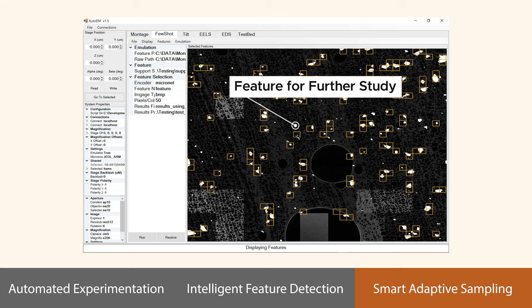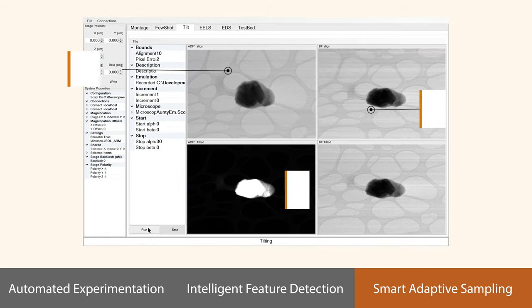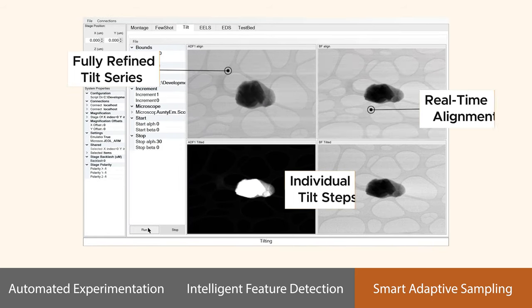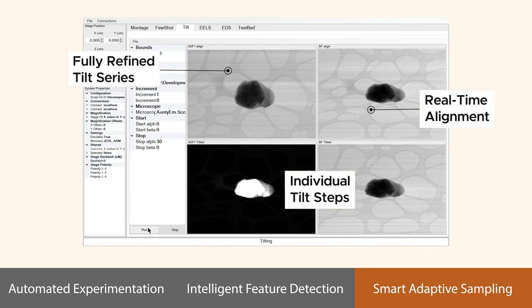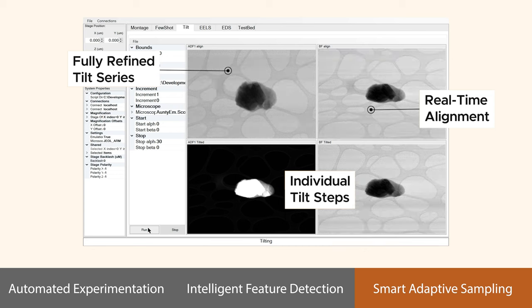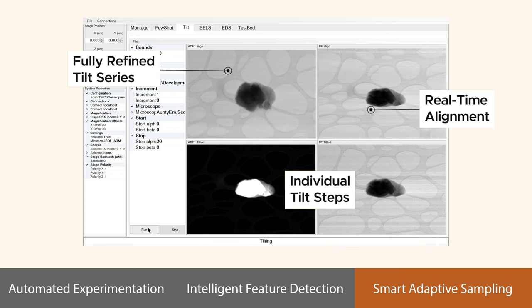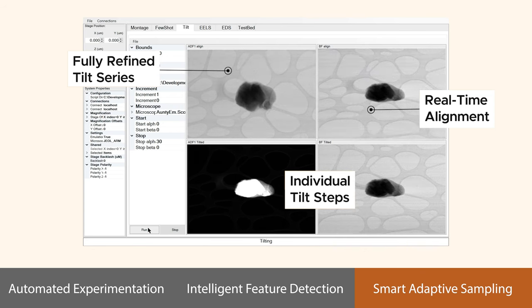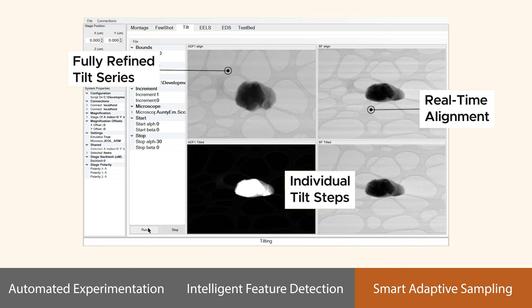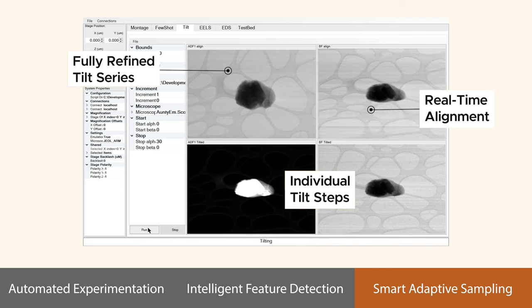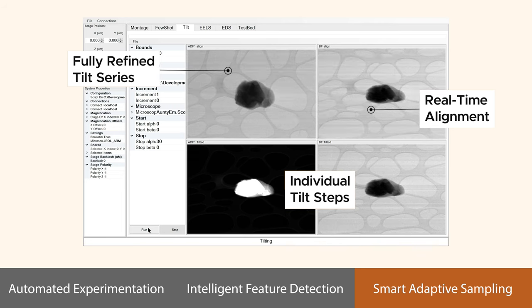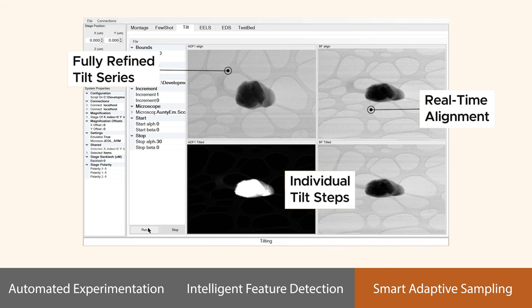For features of interest, the user can ask AUTO-EM to create more refined images by capturing them from different tilt angles, focus settings, and other parameters. This enables the system to precisely navigate to points of interest and obtain detailed 3D information, providing a comprehensive characterization of materials.